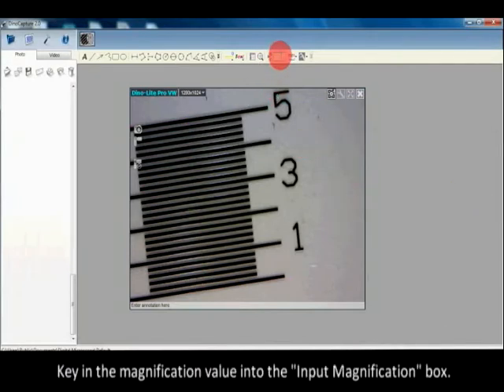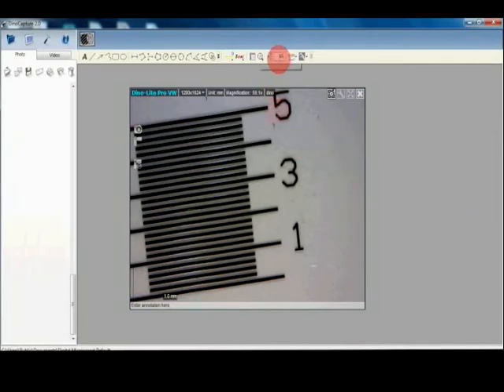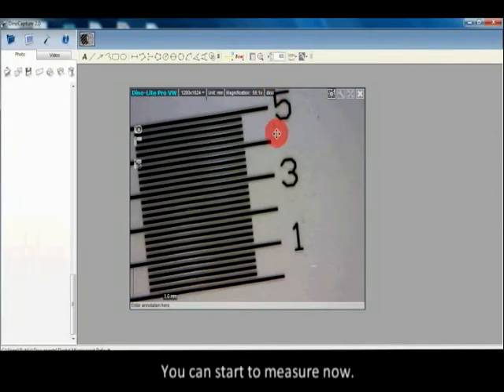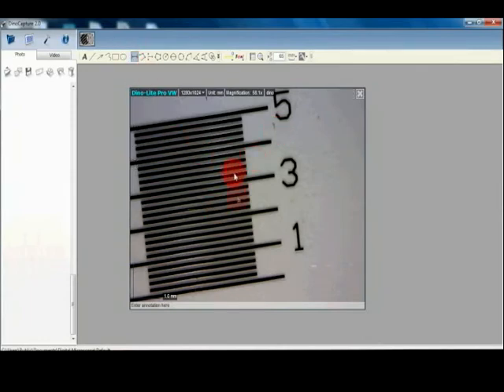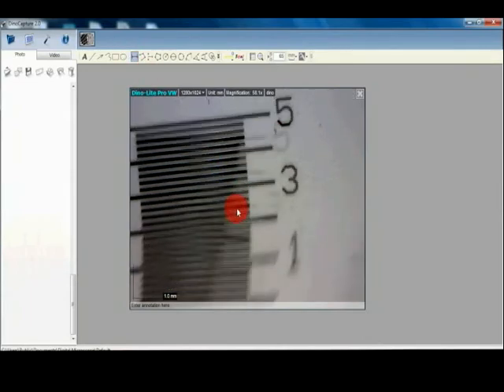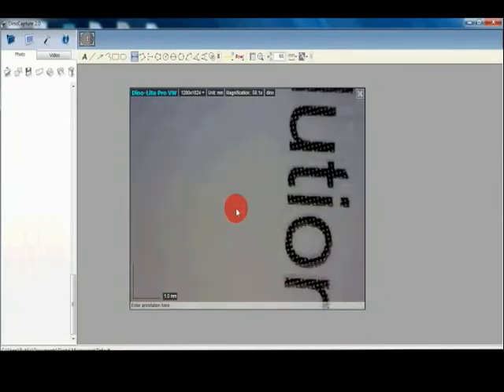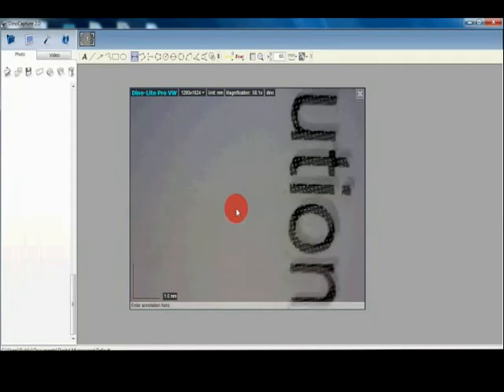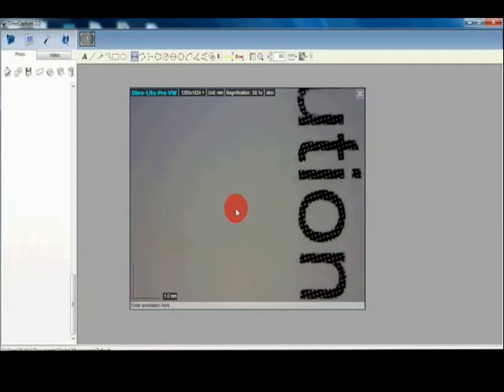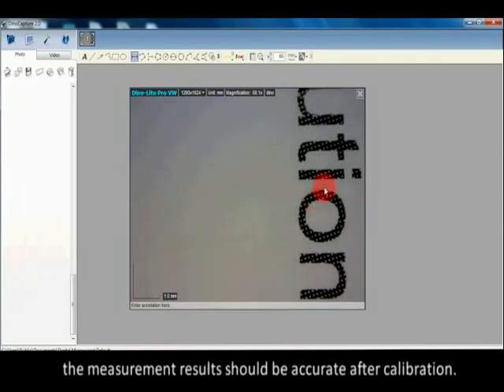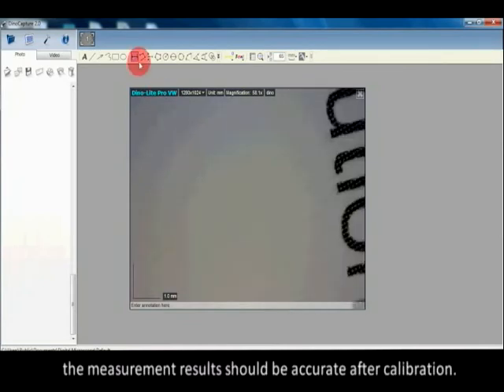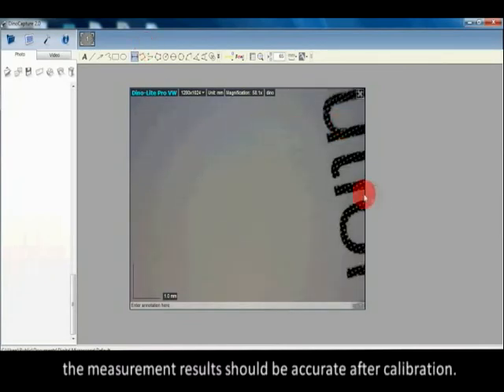Key in the magnification value into the input magnification box. You can start to measure now. The measurement results should be accurate after calibration.